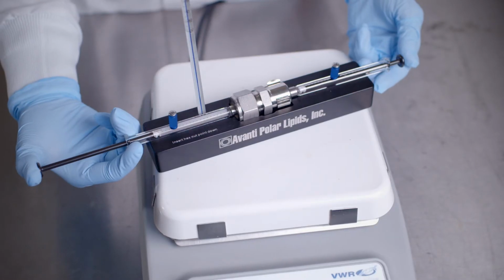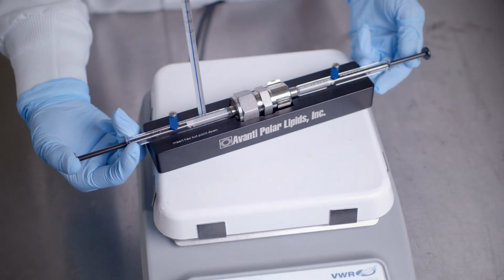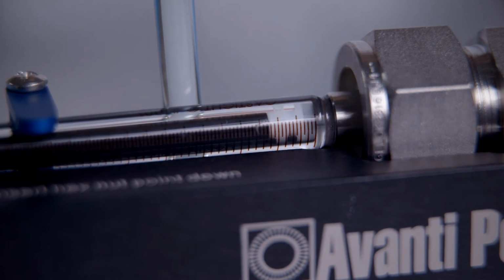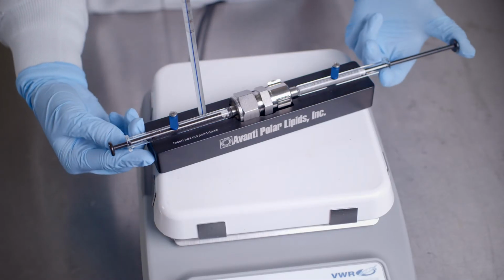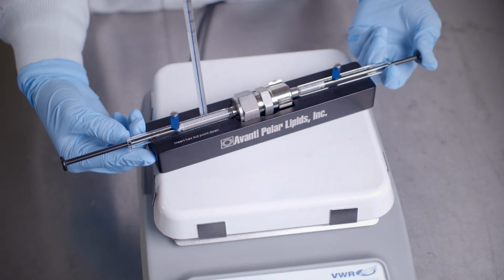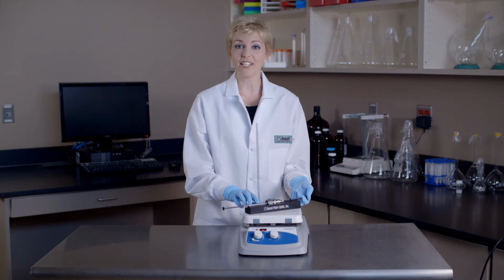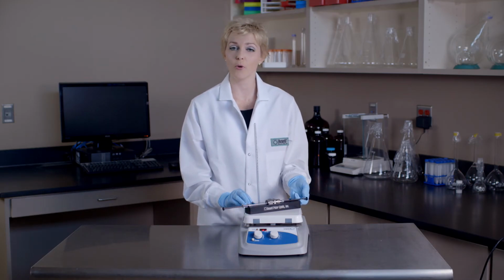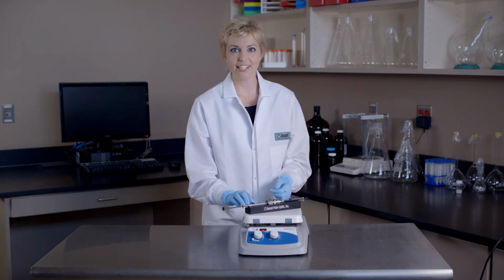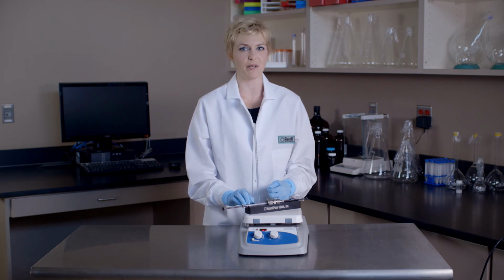To extrude, gently push the plunger of the filled syringe until the lipid solution is completely transferred to the alternate syringe. Then we will gently push the plunger of the alternate syringe until the lipid solution is completely transferred back to the original syringe. Repeat these two steps a minimum of 4 more times for a total of 10 passages through the membrane. In general, the more passages through the membrane, the more homogeneous the lipid suspension becomes.